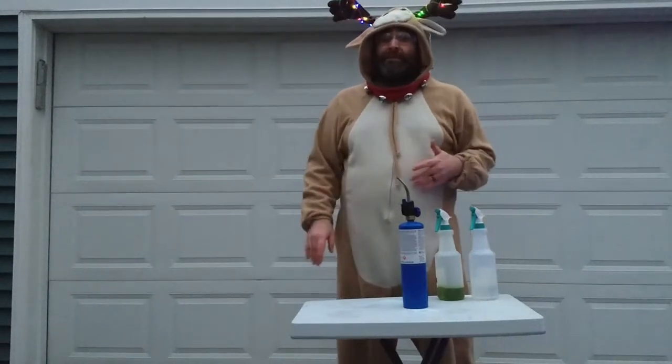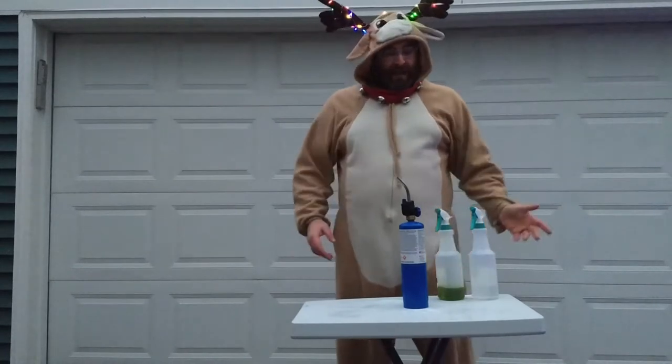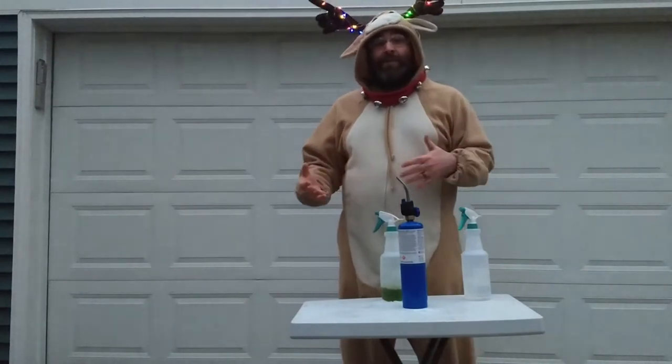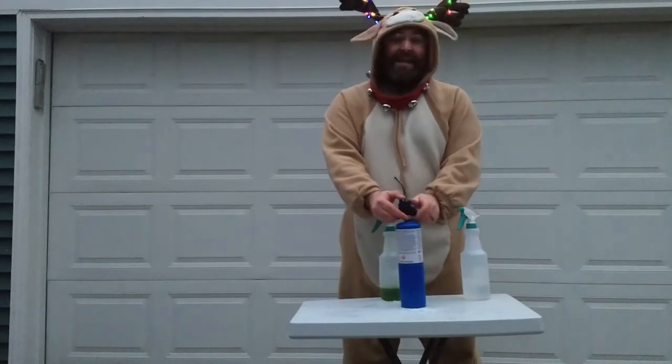You might have had the opportunity to do something called the flame test or flame experiments in your chemistry class. If that's the case, then you know that we take salt solutions and put them under fire, and depending on what the salt is made out of, it emits a different frequency or colored light. Well, this is a variation of that experiment called the flame fireball.